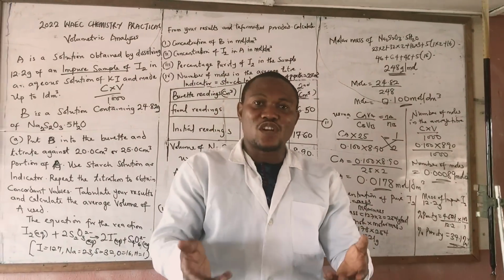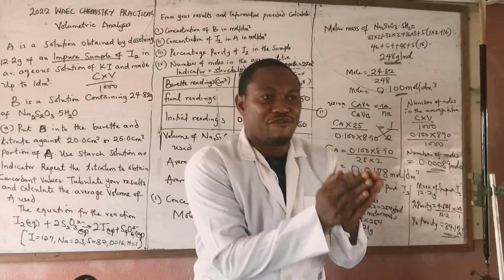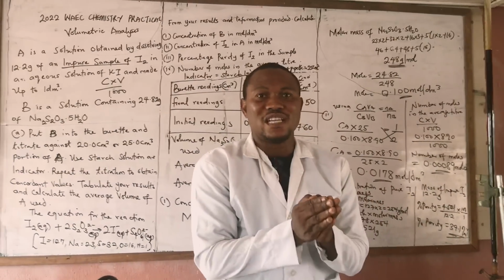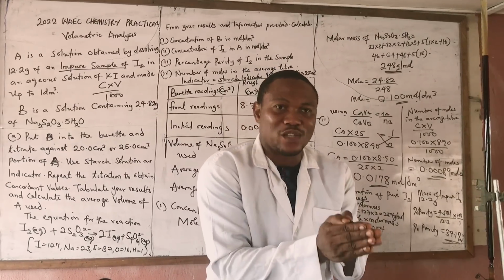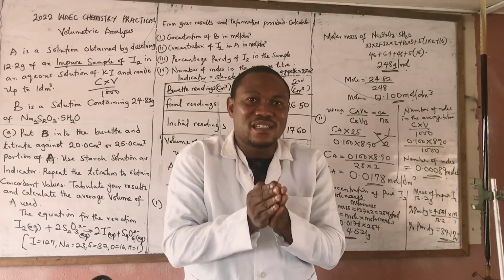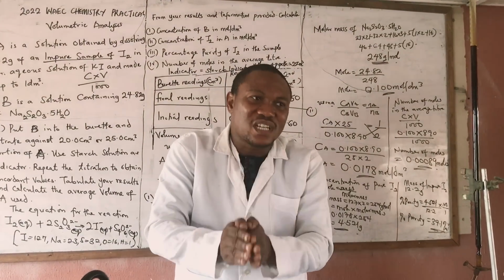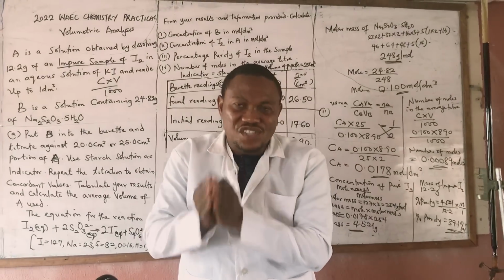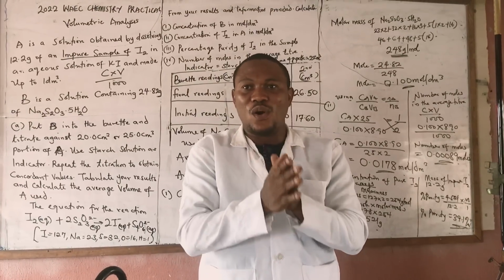So in the instruction on that day, anything they ask us to add, we are going to add, but make sure that we have dutifully prepared according to specification what they ask us to prepare: the iodine, the sodium thiosulfate, the potassium iodide. Please stick strictly, I beg you, stick strictly to those specifications. Don't change them. Stick to them so that we don't actually get wrong readings on that day.